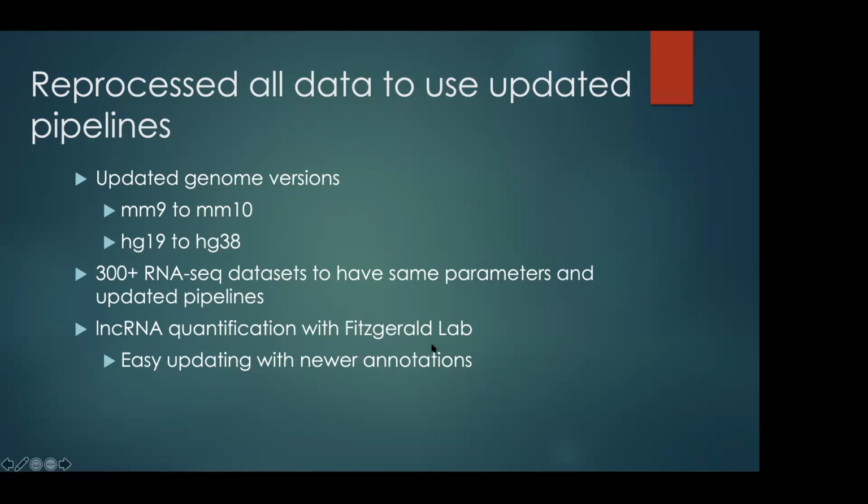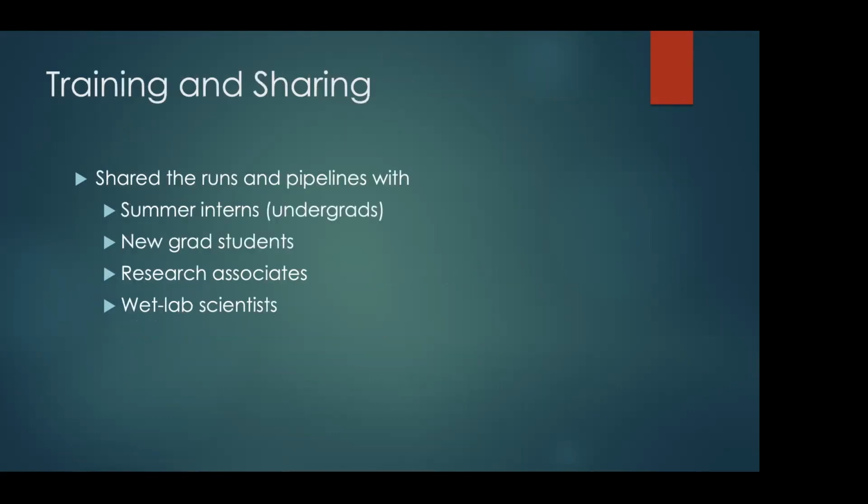I also did the same thing for another project, a vitiligo project with 170 patients, where they wanted to realign everything with the new parameters. And I did everything in 1 weekend. I ran 160 single cell RNA-seq data sets and finished all the runs. It was going to be 1 day, but there was one error in one file, and I needed to spend 1 more day. So in the weekend, I finished everything. It helped me a lot.